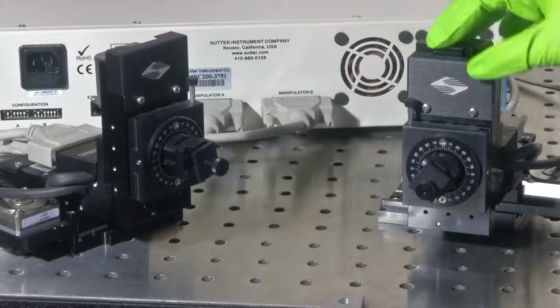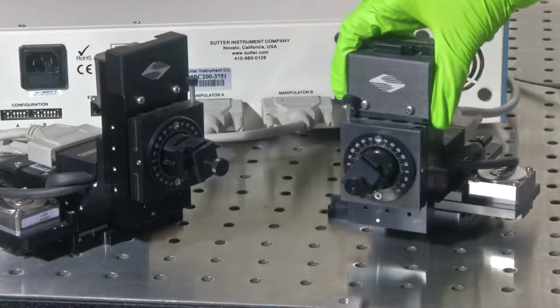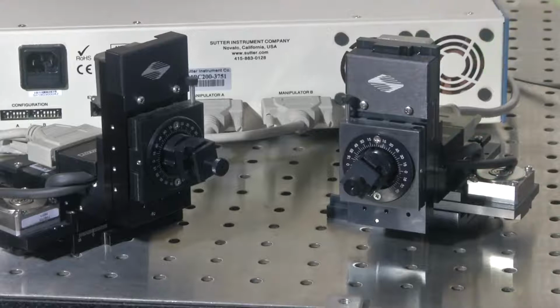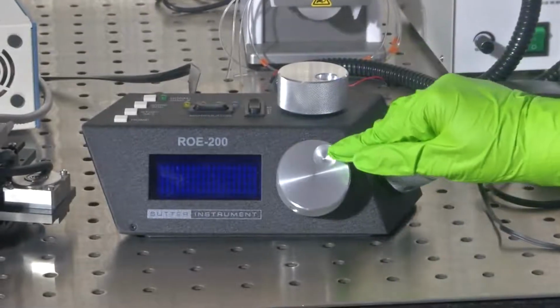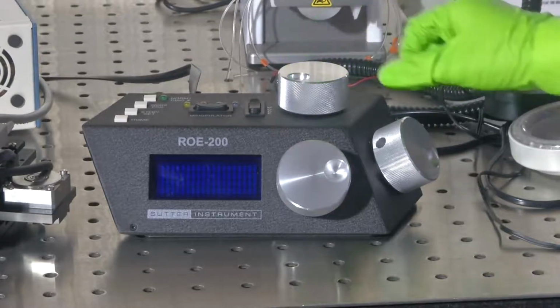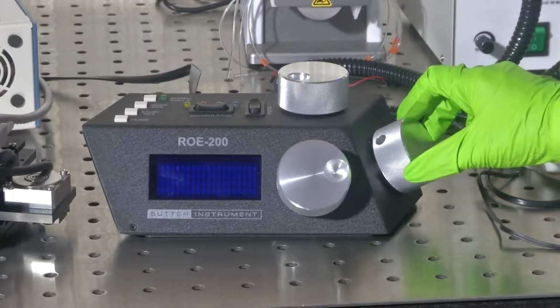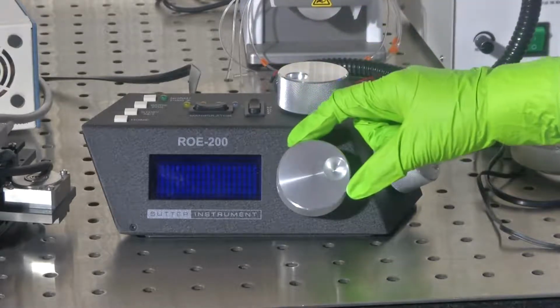Now that we have seen the two manipulators connected to your main unit, let us see the control unit. The control unit has 3 knobs here, 1, 2 and 3. This is again for the x axis, this is for the y axis and this is for the z axis.